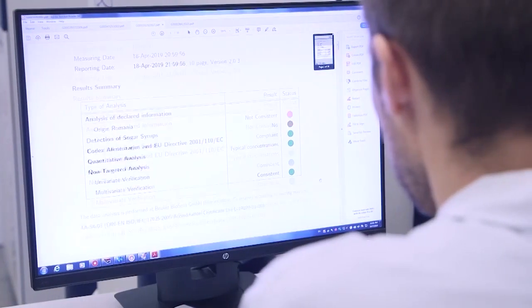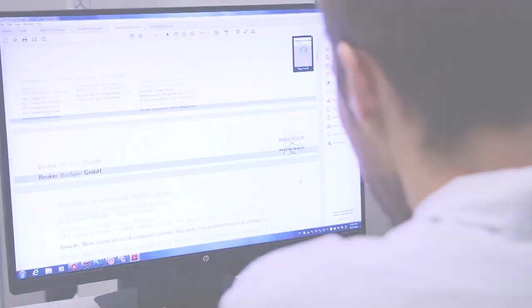When the analysis is completed, an analysis report is automatically generated for each sample.